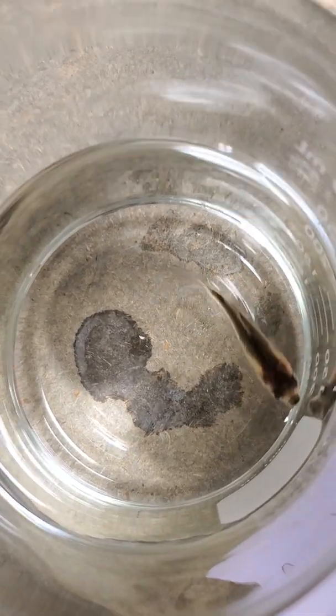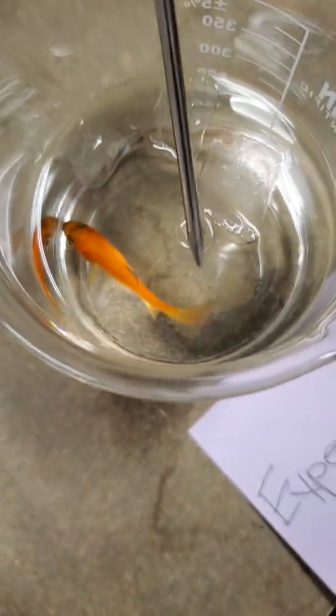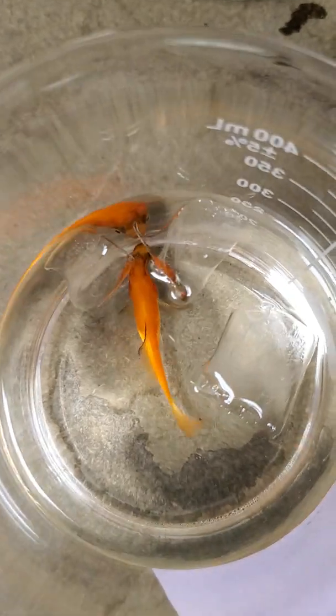And time. We're going to move on to our experimental goldfish. It is 12.4 degrees Celsius is the temperature. And start.